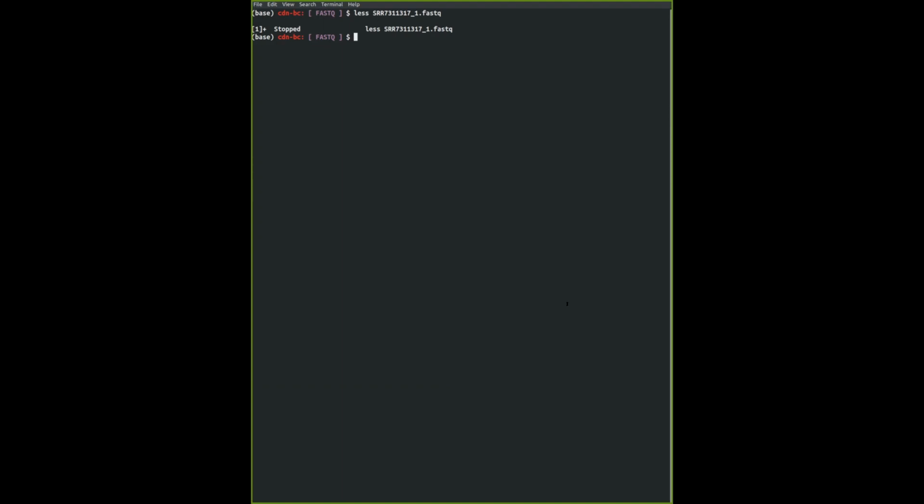But then you can do some sort of search or pattern search in terminal. So earlier on, I showed you, in a very bad example, how to search for N in less. It takes quite a while because it has to do a couple of searches. But there is another function called grep. And what grep does is it does a search function on your file.